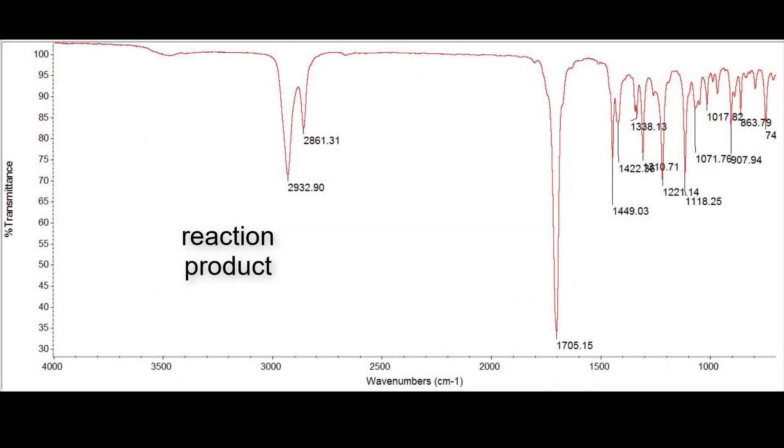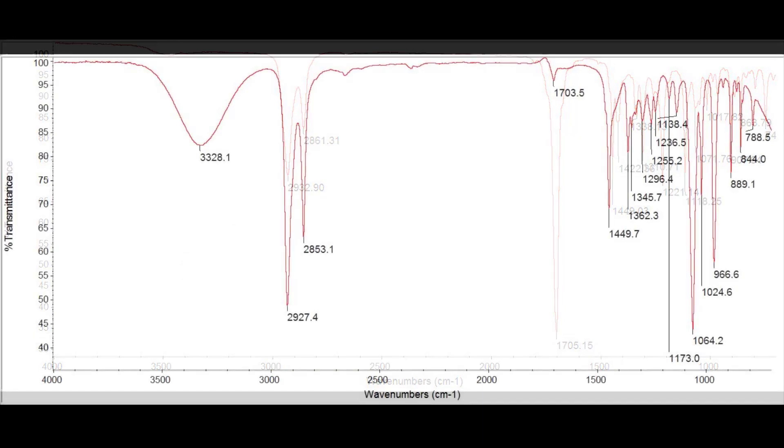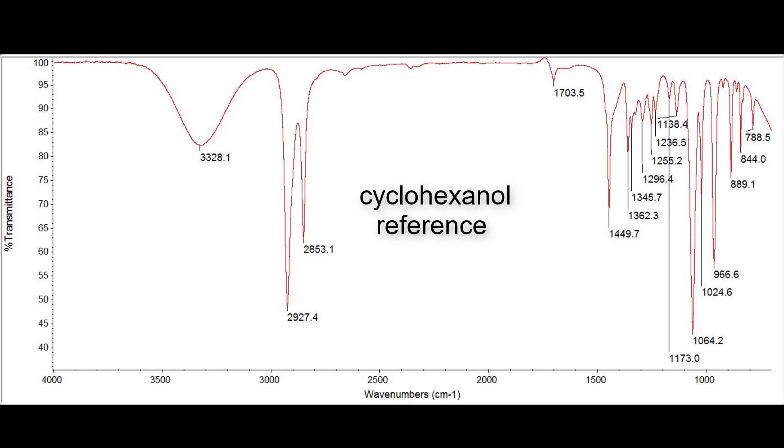Here's a high-resolution spectrum of the reaction product. If you're taking the lab online, take a screenshot of this image to use in your lab assignment. You'll also need to use this reference spectrum of cyclohexanol, the starting material, in your lab report as well. The idea is to compare the two spectra and see what changed.